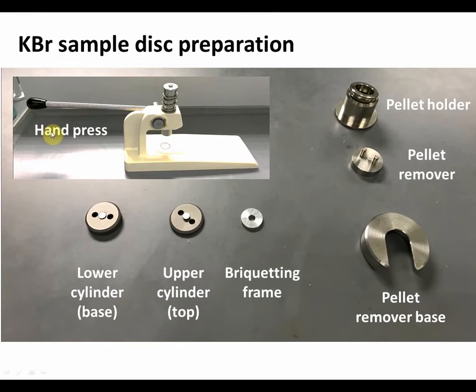You will also need the hand press during the preparation of the disc. Now we will show you a demonstration on the steps to prepare the sample.